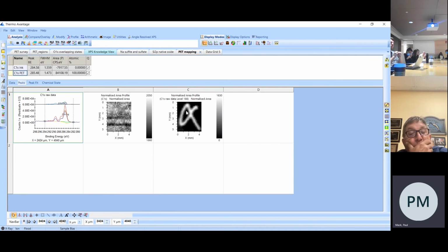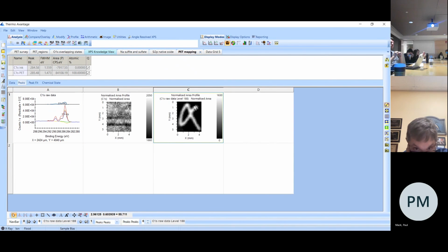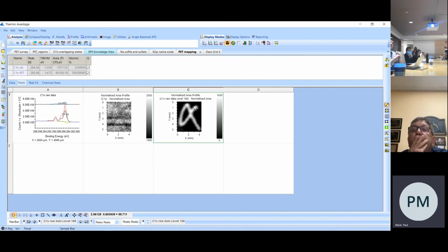And what this means is every other spectrum, you take a linear combination of those two spectra, and you can fit every other spectrum. So TFA is a way where the software can automatically find a few spectra to fit everything, and then fit the rest of the data set using those few spectra automatically. So it can be thought of as a way of identifying different chemical areas on the surface, and it finds them for you so you don't have to.